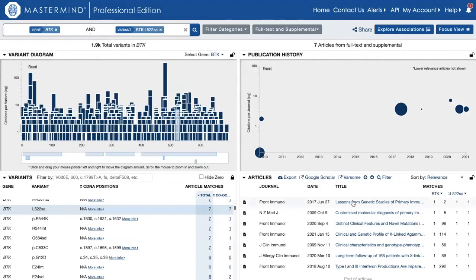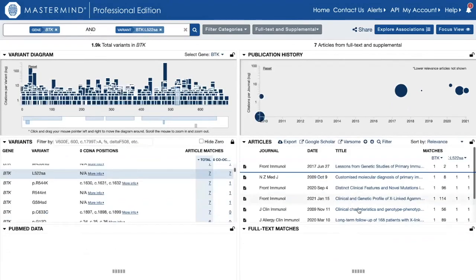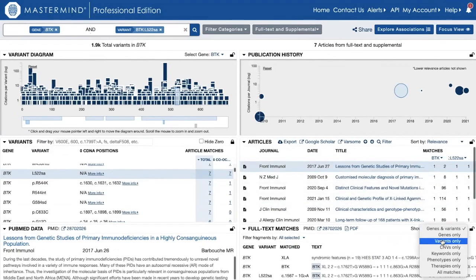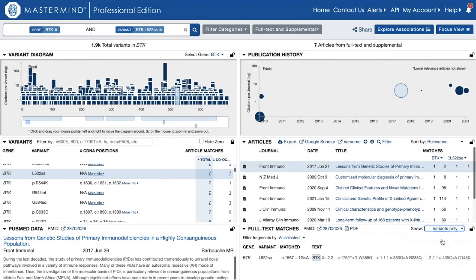Then I can see exactly which variant is being represented when I look at my sentence fragments. I'm going to view my article, select variants only, and then I can immediately see the cDNA position being represented as well as the transcript information.